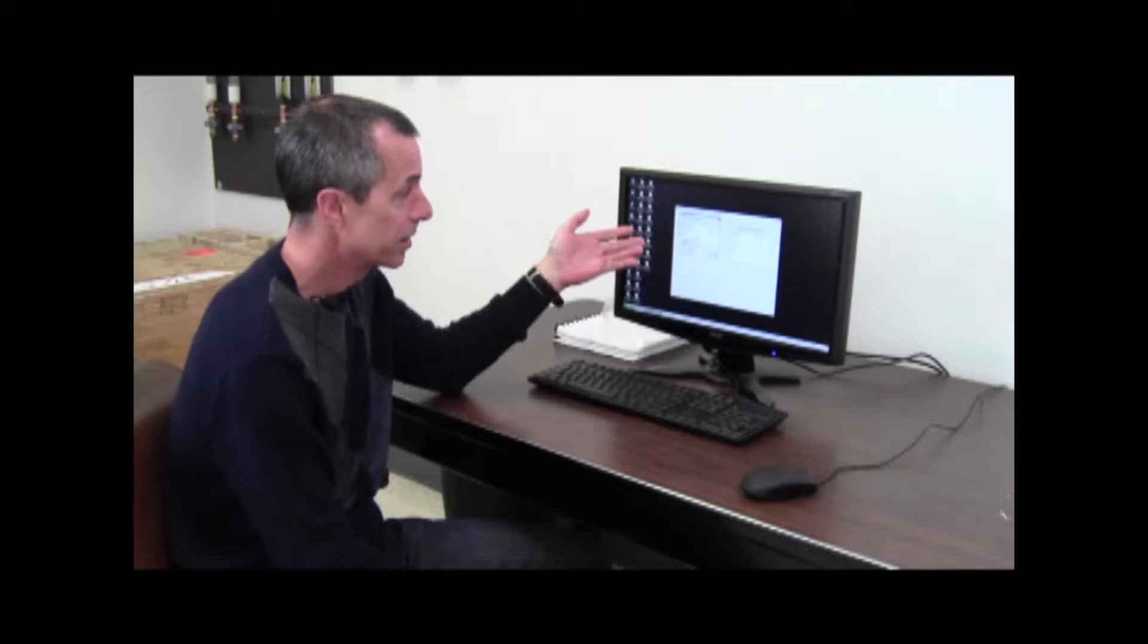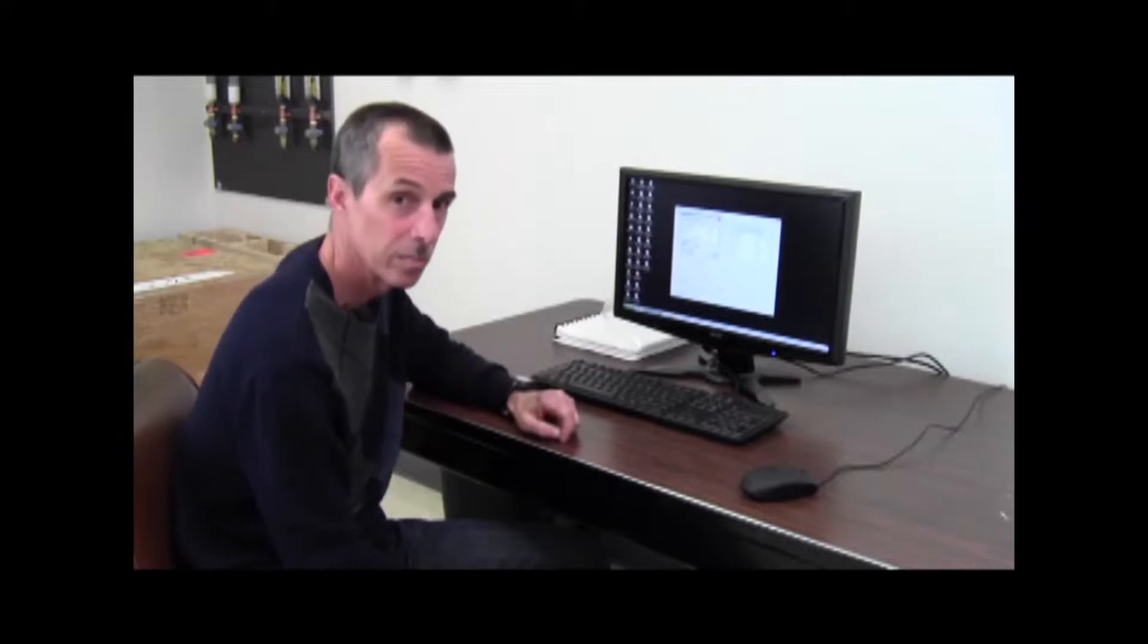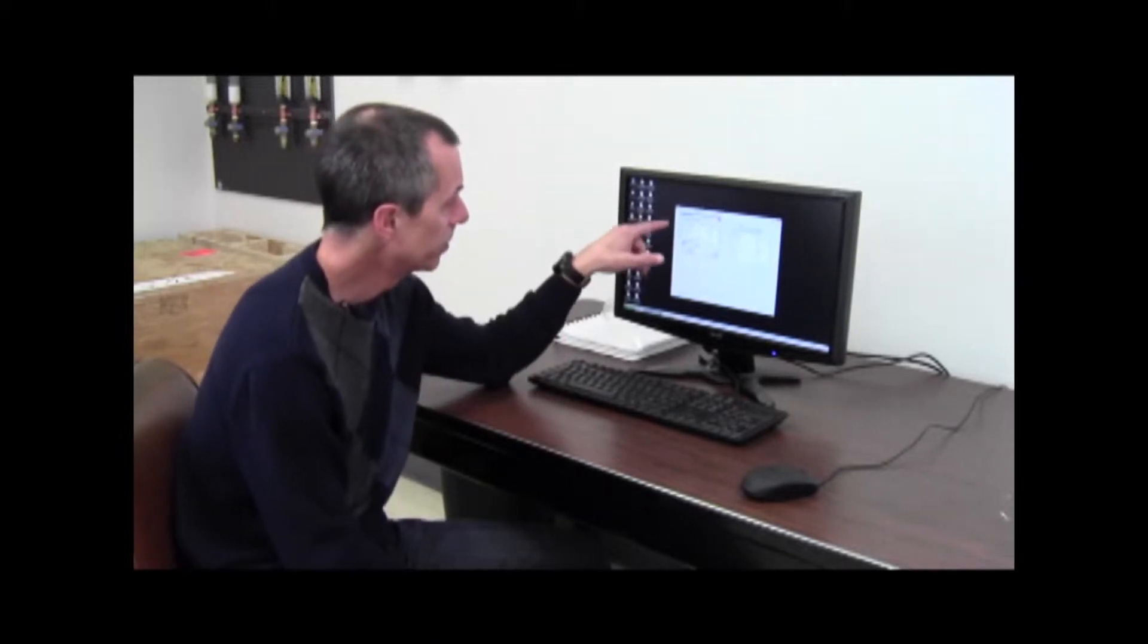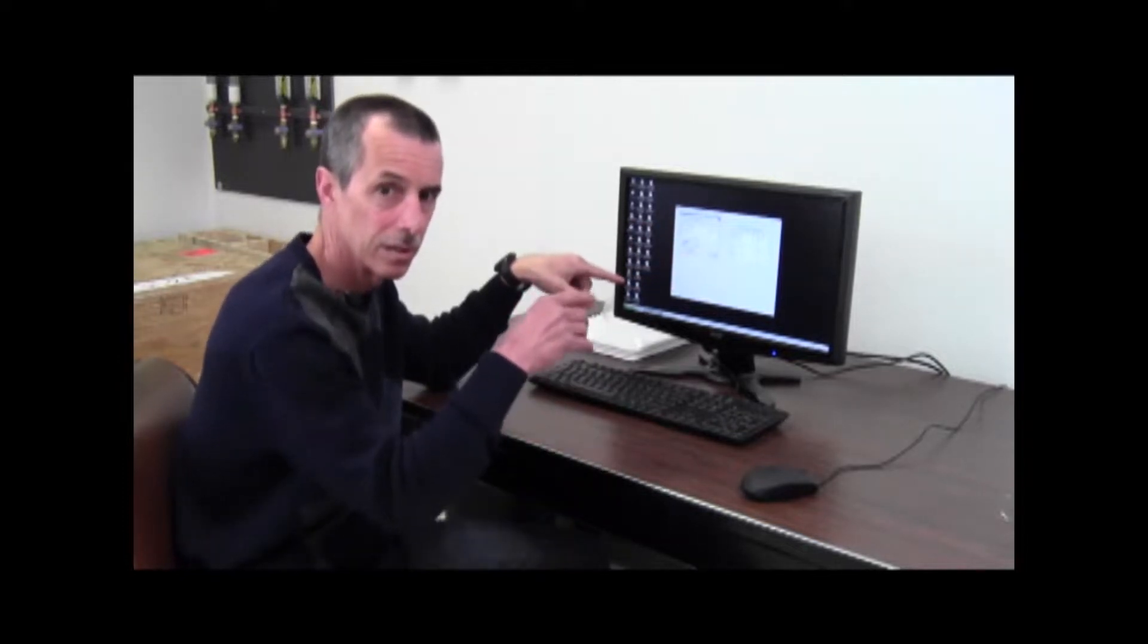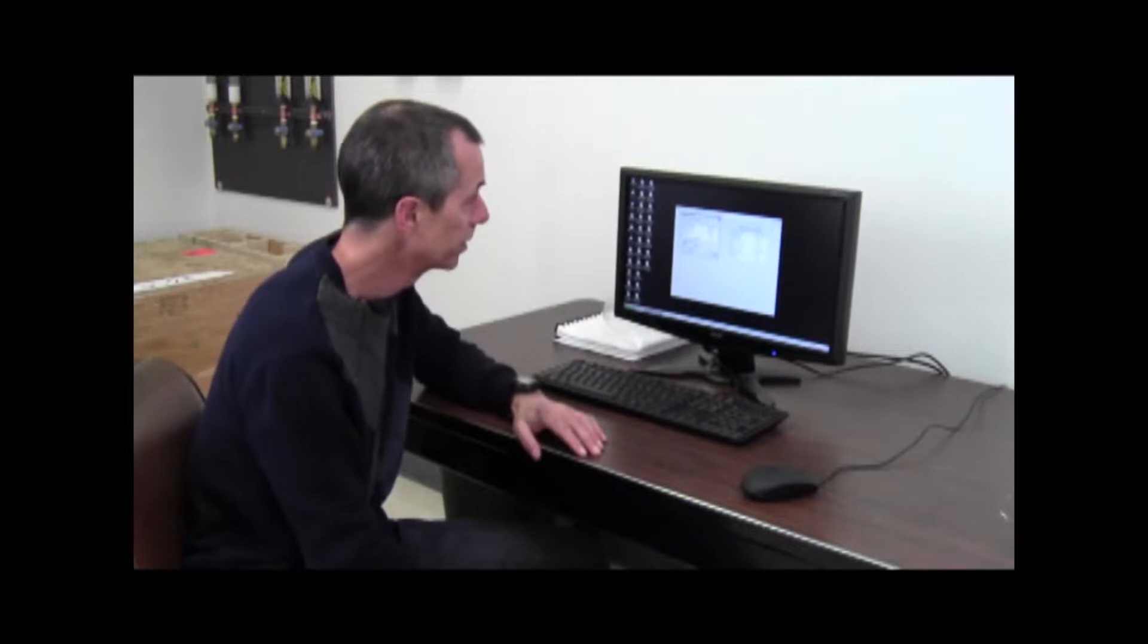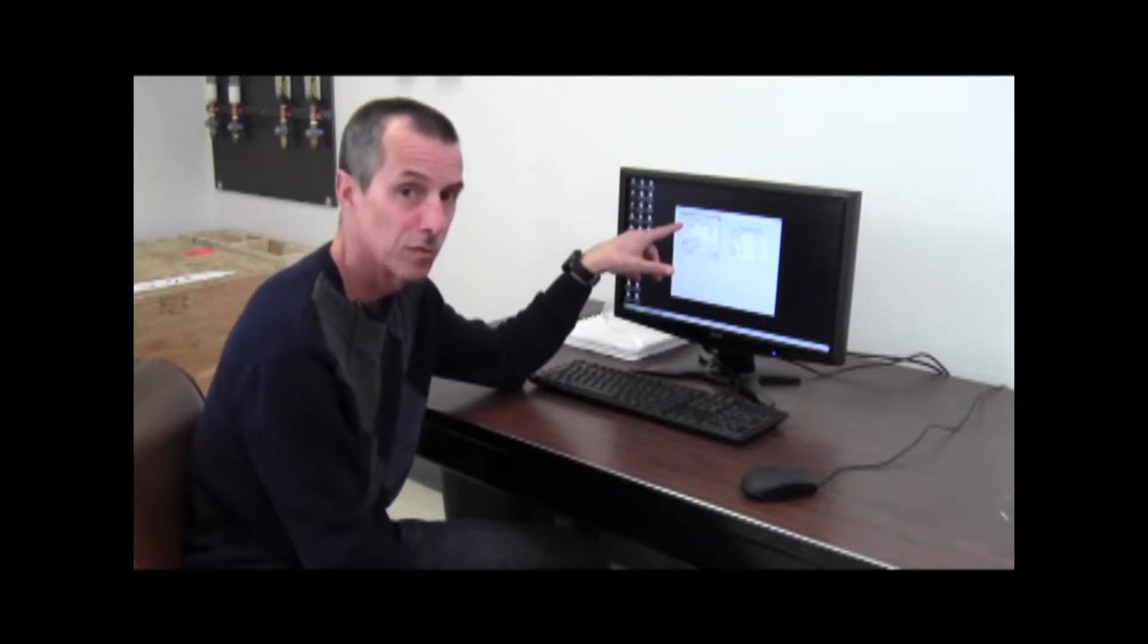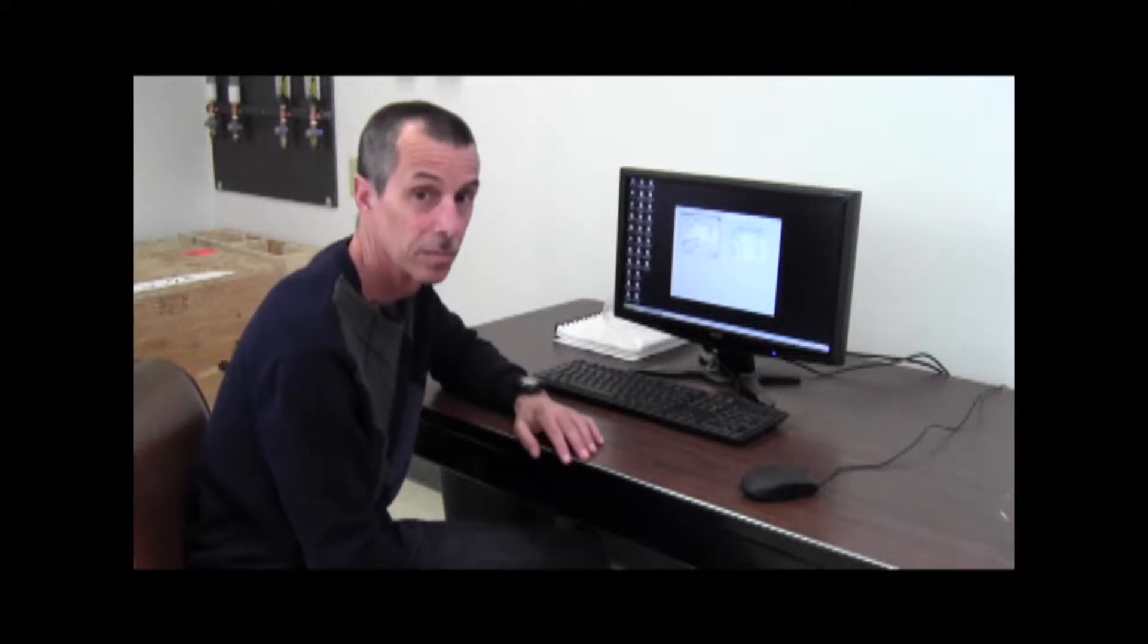This is the Micromag Magnetometer data acquisition software. What I'm doing here is quickly setting up a hysteresis loop measurement. I'm going to start at plus four kilo ersted, ramp to minus four kilo ersted, and then complete the rest of the loop by ramping back to plus four kilo ersted.